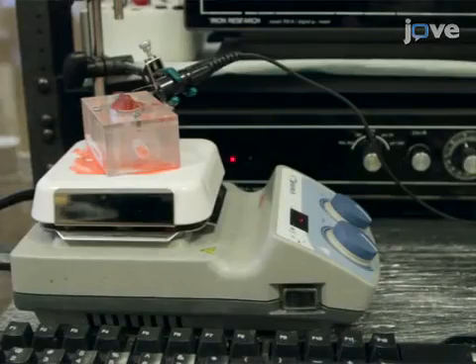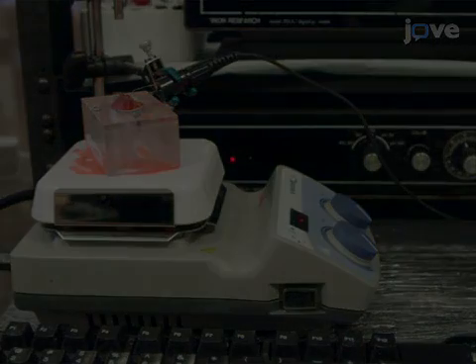The recording setup consists of 2 chambers, a chloride electrode, a pH meter with an analog output.